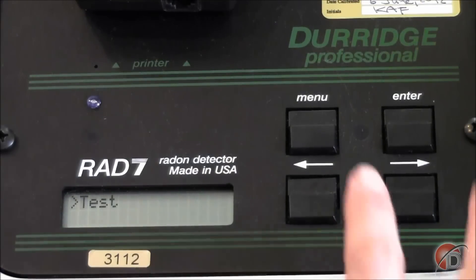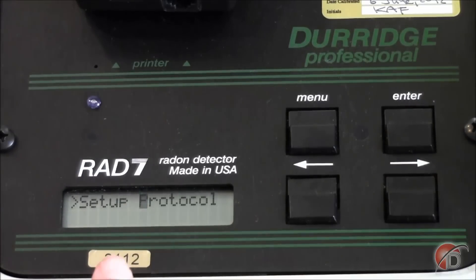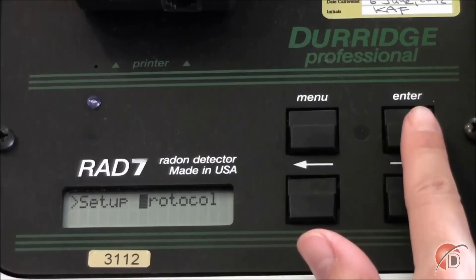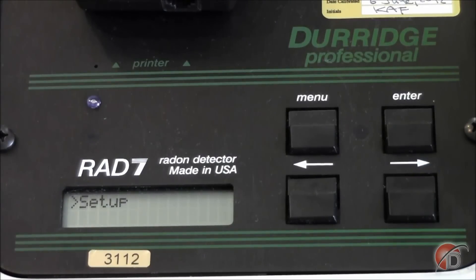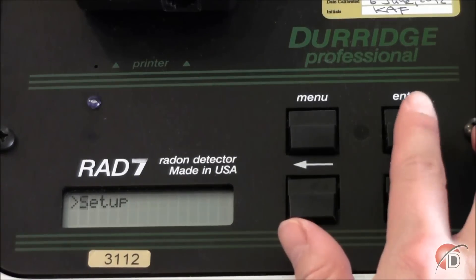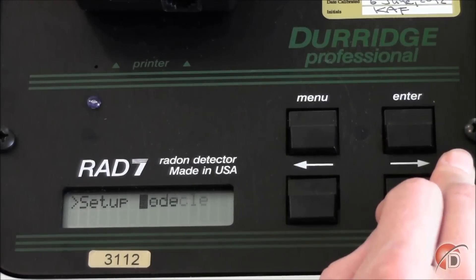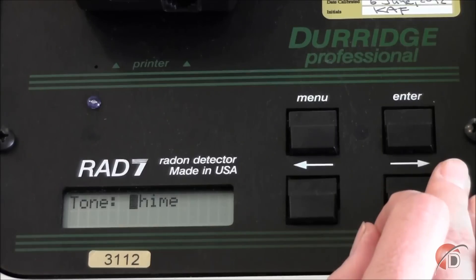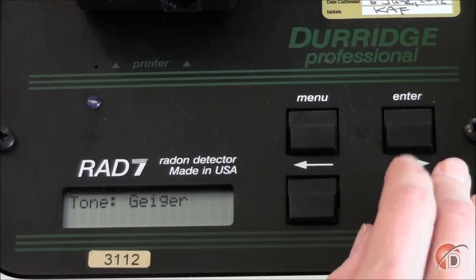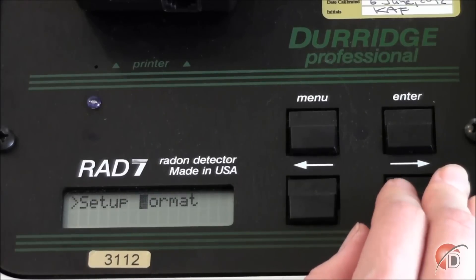To program the RAD7 for our one-day reading, press Menu and arrow over to Setup, then press Enter. The first parameter we encounter is Protocol. At Protocol, press Enter and arrow over to One Day. This protocol is programmed into your RAD7 and tells it how to take its measurements. We can check how these measurements are run by arrowing through the rest of the setup displays. The Tone option is not set by the one-day protocol — we can set it to Chime to hear a chime at the end of each cycle, or Geiger to hear beeps during counts. Because we are in an office environment, I am going to change this option to Off.